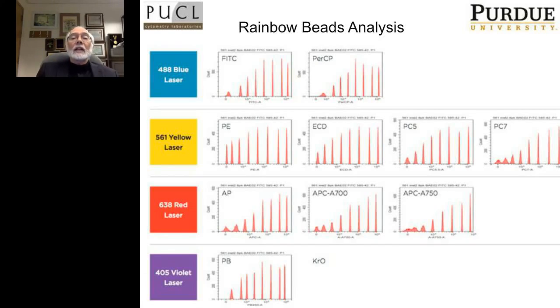And looking at particular dyes that are of interest in hematology, in clinical lab, some of the dyes that you see on here show excellent resolution and sensitivity.